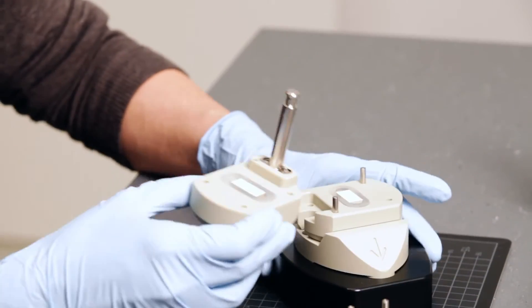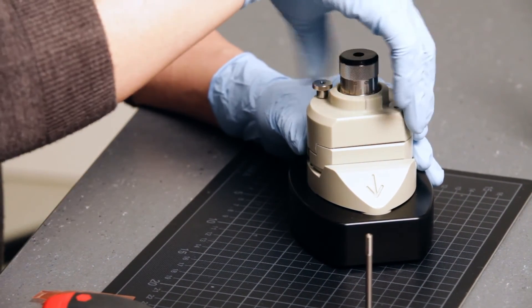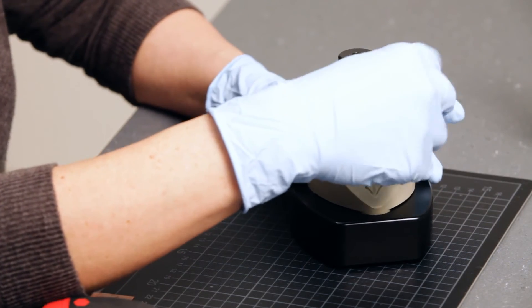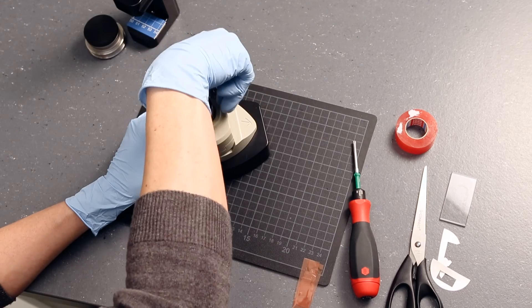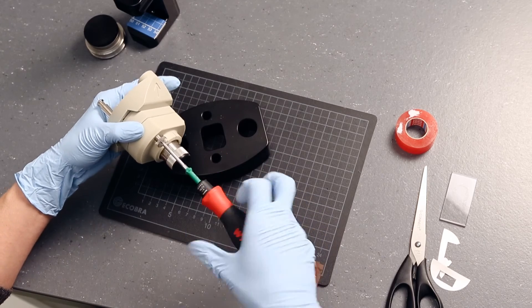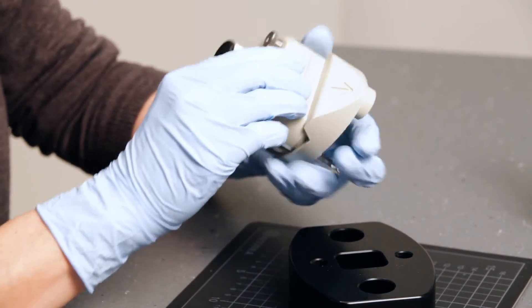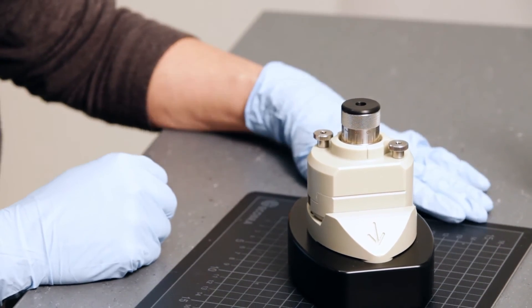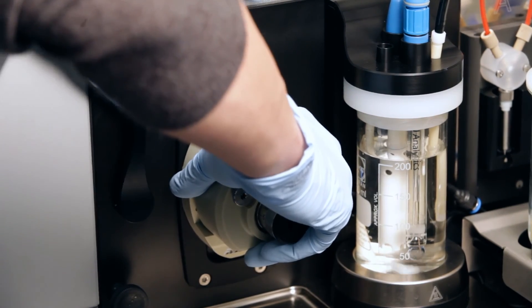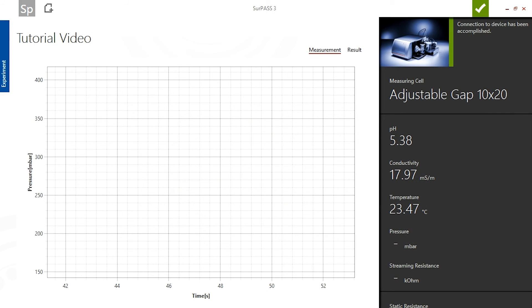Close the measuring cell and fix the halves with the screws. Use the screwdriver to tighten the measuring cell completely. Now you can mount the measuring cell on the instrument. Simply plug in the cell and lock it by turning the lever to an upright position. The adjustable gap cell 20 times 10 is then recognized by the Surpass 3 software.